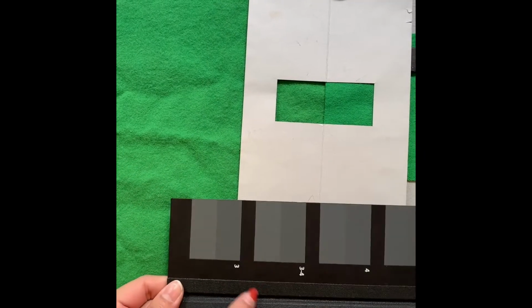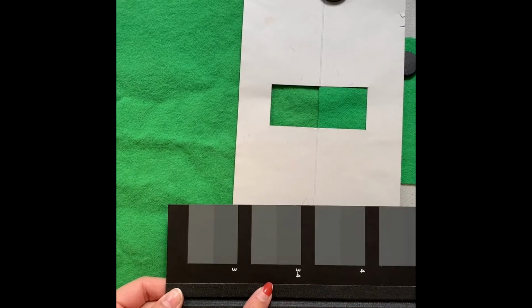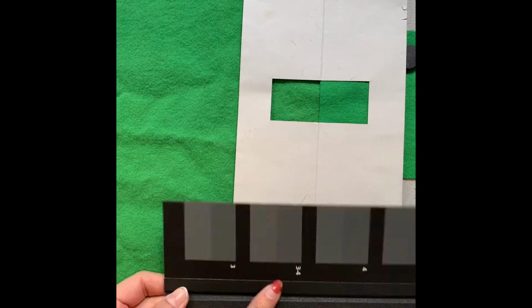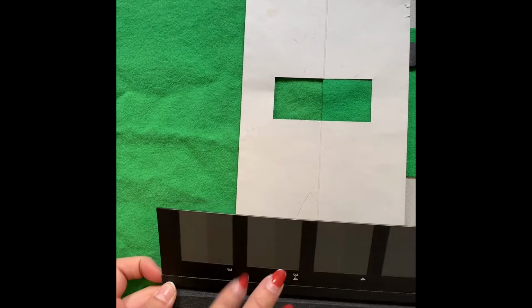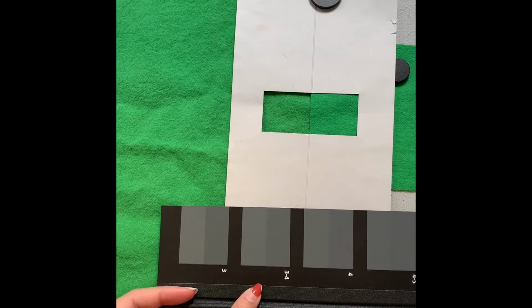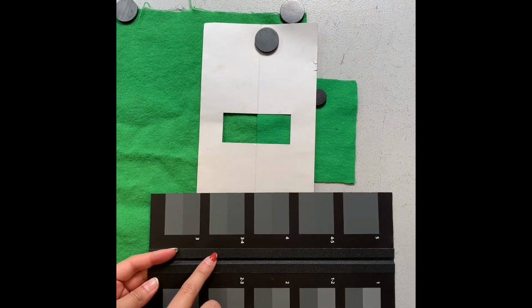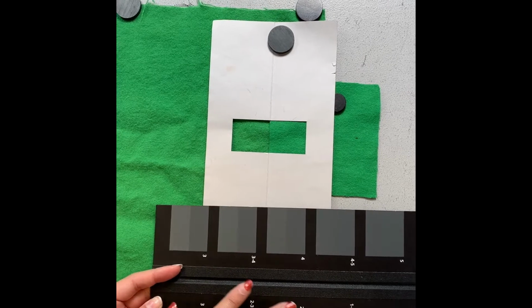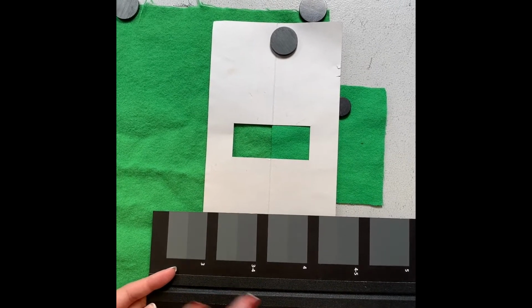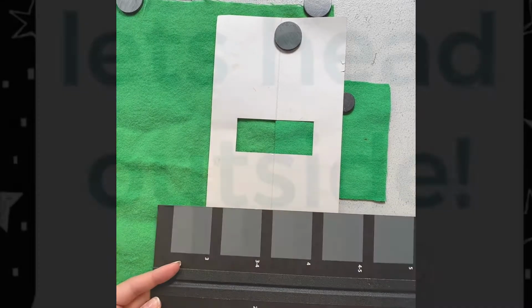Because our color rating was between a 3 and a 4, our minimum requirement for our fabric, according to the ASTM requirements, it is a significantly low rating for our product. But because our product is pajama bottoms, it doesn't really signify any real importance, because it will mainly be used indoors and will not be affected by weathering that often. So it is practical for our end use, but it should be avoided from weathering overall.